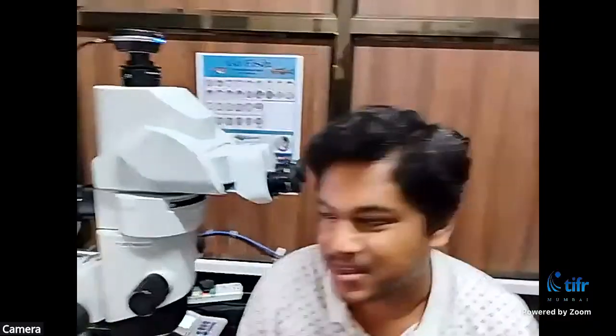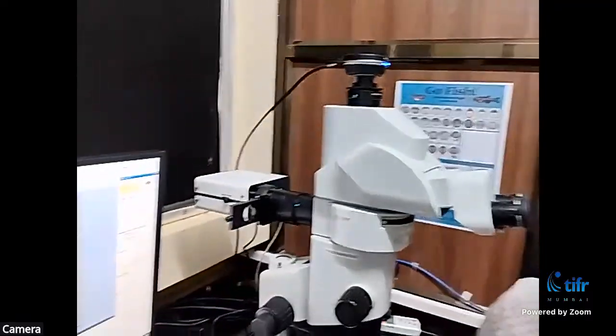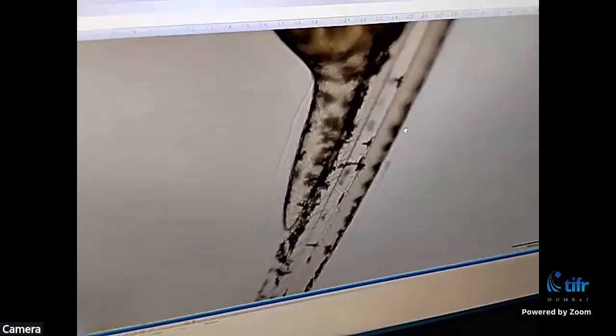Yeah, never mind. We wanted to show you the circulating blood, but through the camera, it's not very clear. So maybe you can just point the mouse on that and run the mouse through it. Yeah, so here there are arteries and veins, in which you can see the flow of the blood. But in the camera it is not that visible.